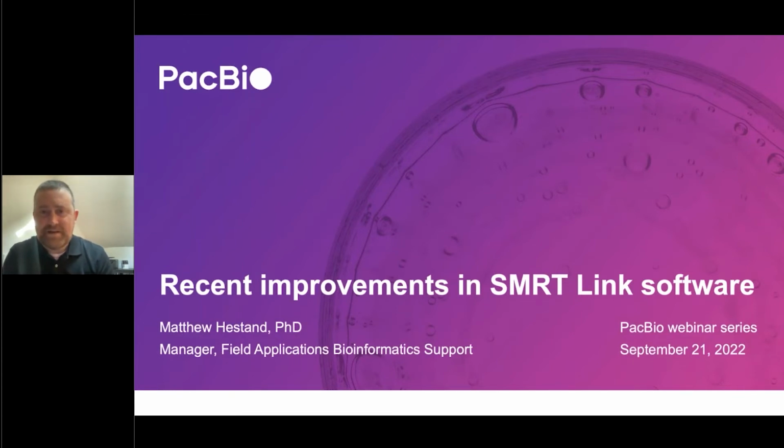First, I'm going to spend about 10 minutes as a primer for Aaron's talk, giving a general introduction to the recent improvements we've made in SMRT Link in the past couple of months.